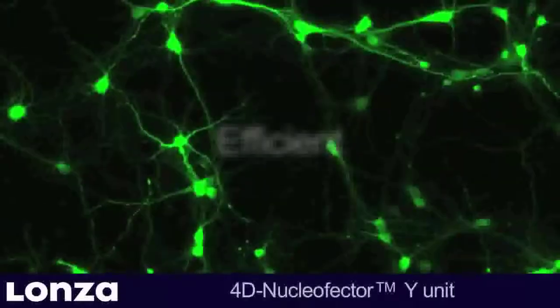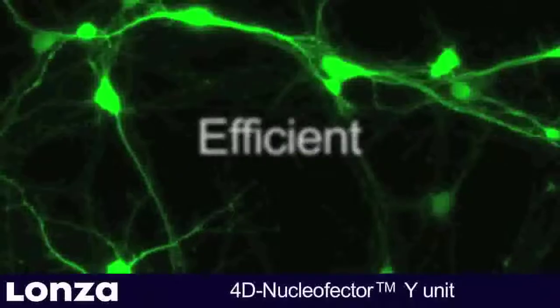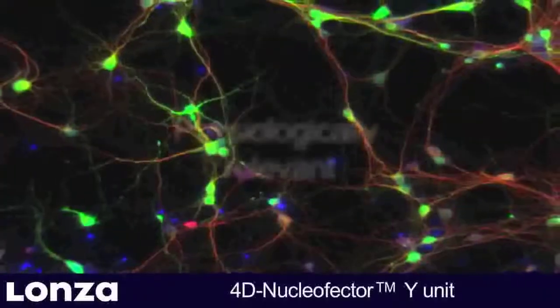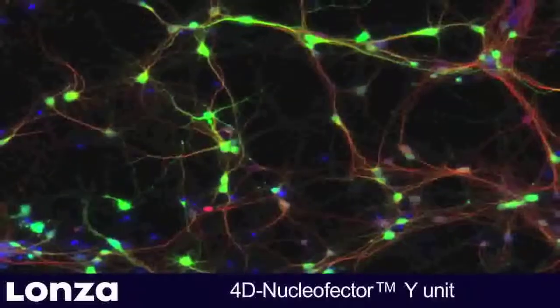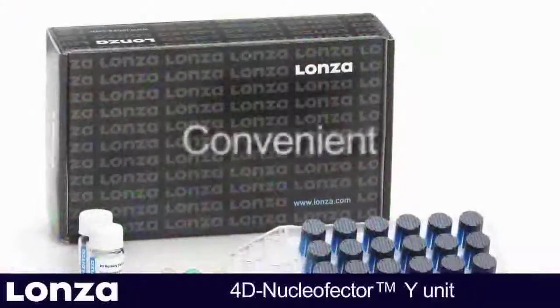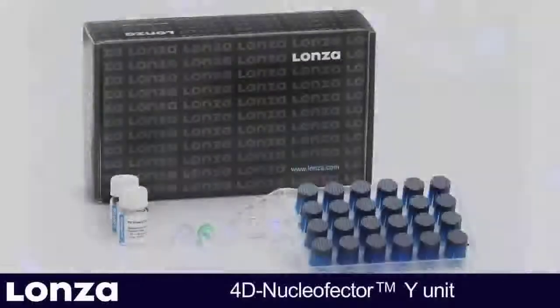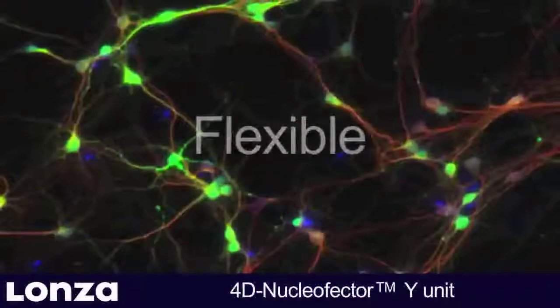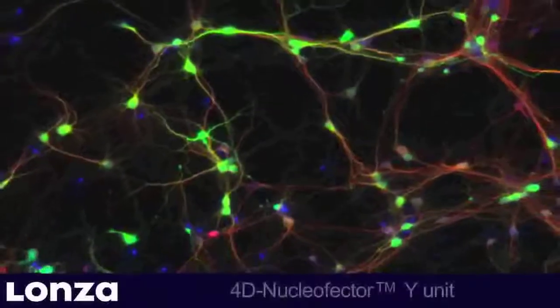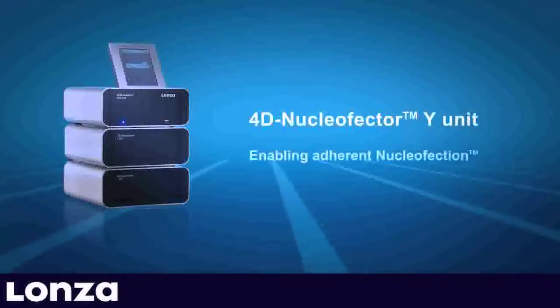The 4D Nucleaffector Y-Unit. Efficient — achieve up to 70% transfection efficiency in neuronal networks. Physiologically relevant — nucleaffection of neurons at later developmental stages. Convenient — straightforward handling using standard 24-well culture plates. Flexible — suitable for post-transfection analysis by confocal microscopy or patch clamping. The 4D Nucleaffector Y-Unit, enabling adherent nucleaffection in 24-well culture plates.